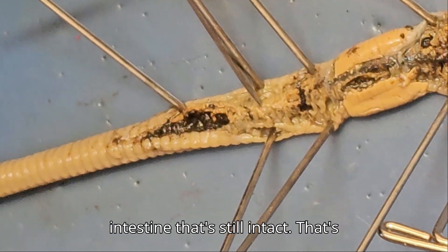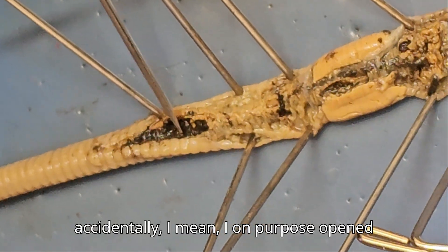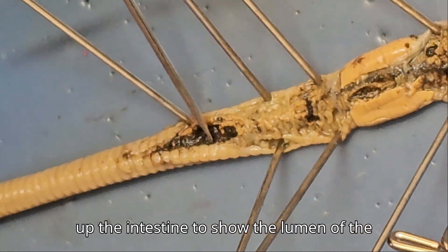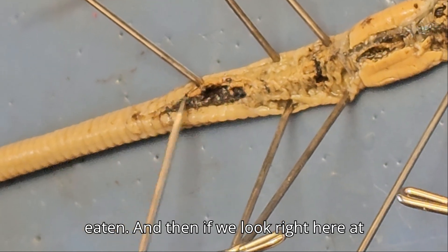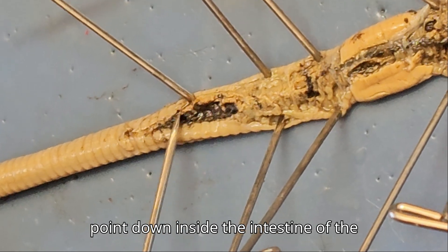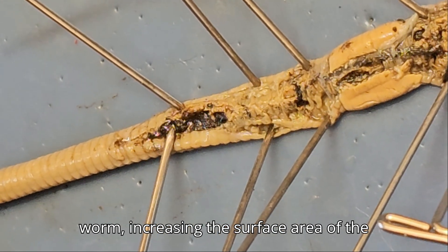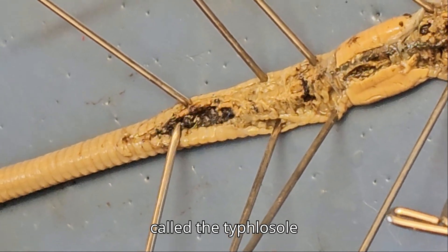Moving further back in the worm, we have the intestine that's still intact — that's that piece right there. I opened up the intestine on purpose to show the lumen of the intestine. This is dirt the worm has eaten. And then if we look right here at the edge, we can see there's a ridge. That ridge would normally point down inside the intestine of the worm, increasing the surface area of the inside of the intestine. That ridge is called the typhlosole.